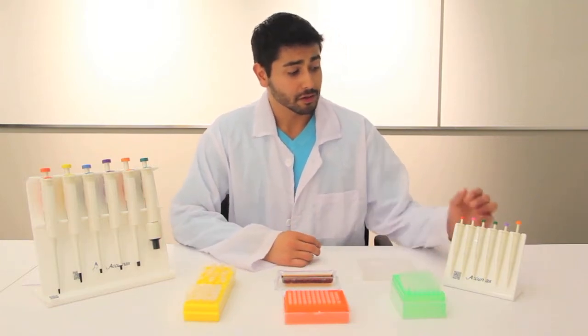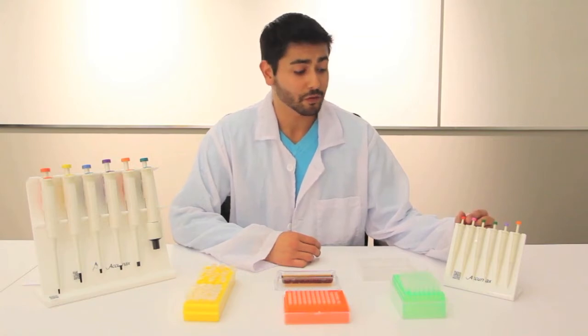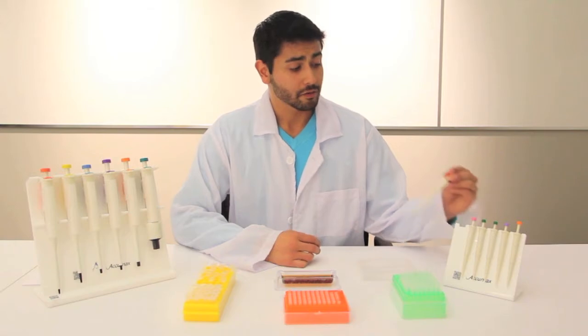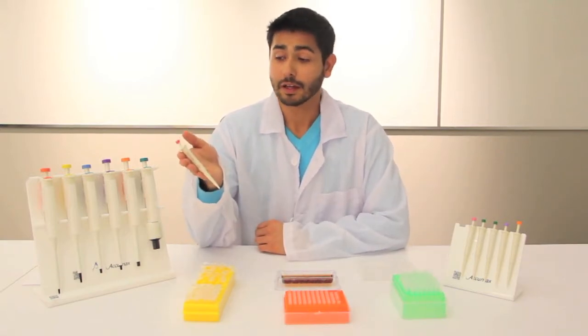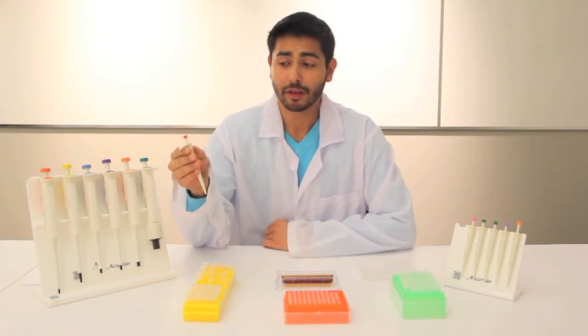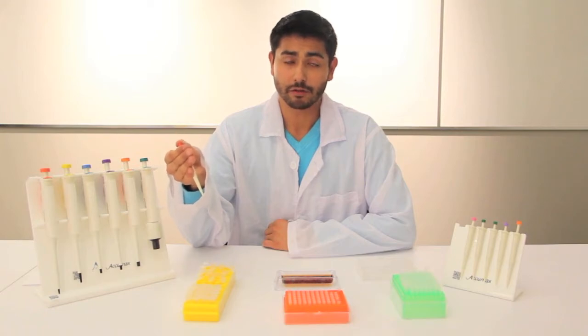The AcuMax Junior Pipettes are smaller fixed channel pipettes that range in volumes from 5 microliters to 100 microliters. They have quite a few unique features. They're very small and easy to transport, great for scientists on the go. They feature a two-stop mechanism that you see on a traditional pipette.